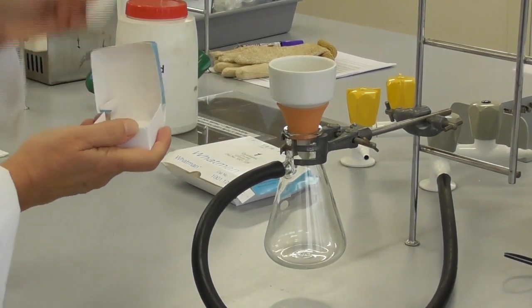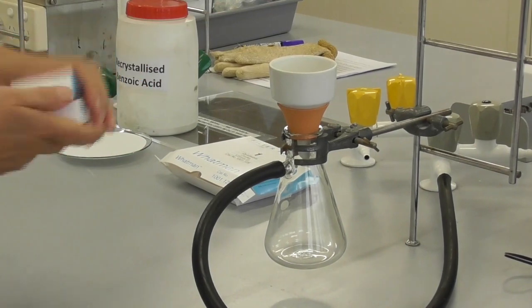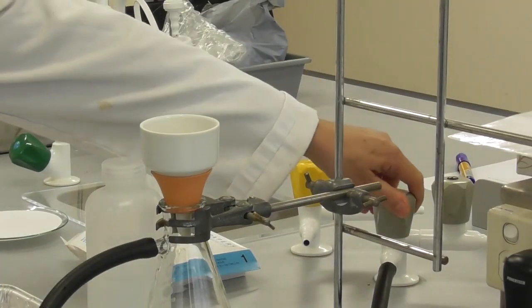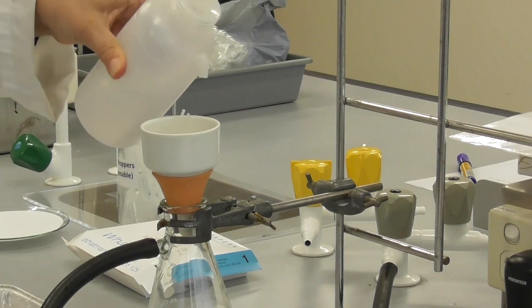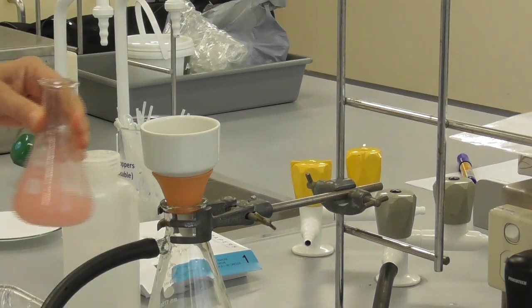We insert the filter paper into the buchner funnel. When we are ready we turn on the vacuum and wet the filter paper by adding a little bit of distilled water into the buchner funnel.